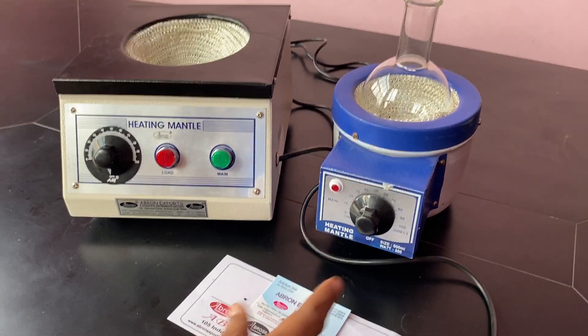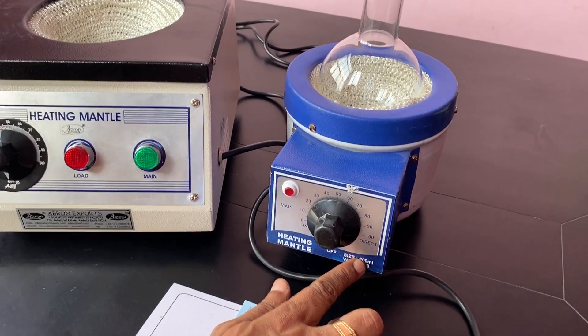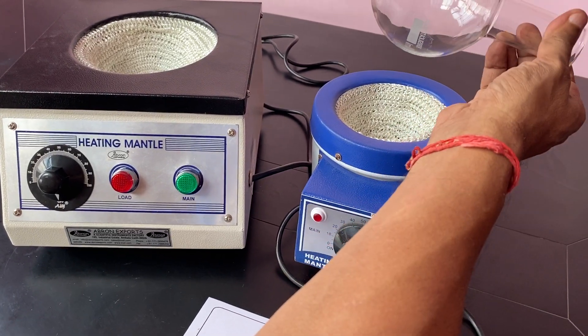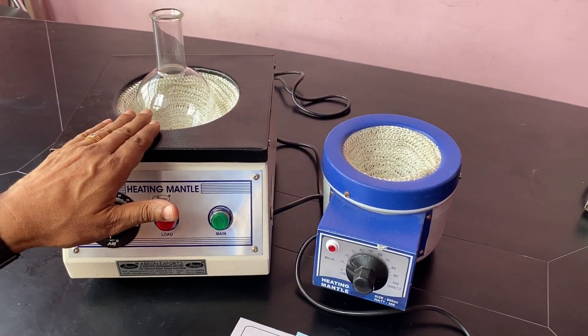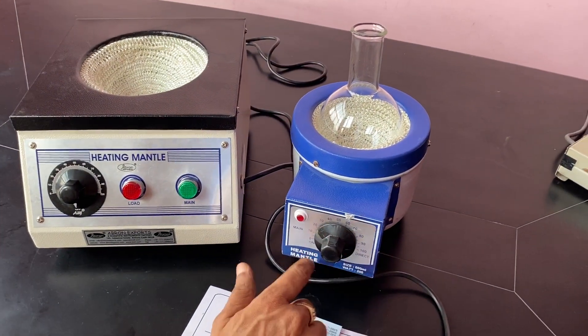This is a heating mantle which is 500 ml capacity; this one is 2 liters capacity. You can put the flask — better to use the same capacity round bottom flask. It is only suitable for round bottom flasks. This one is better for 1 liter, 2 liters, 500 ml, or 250 ml.